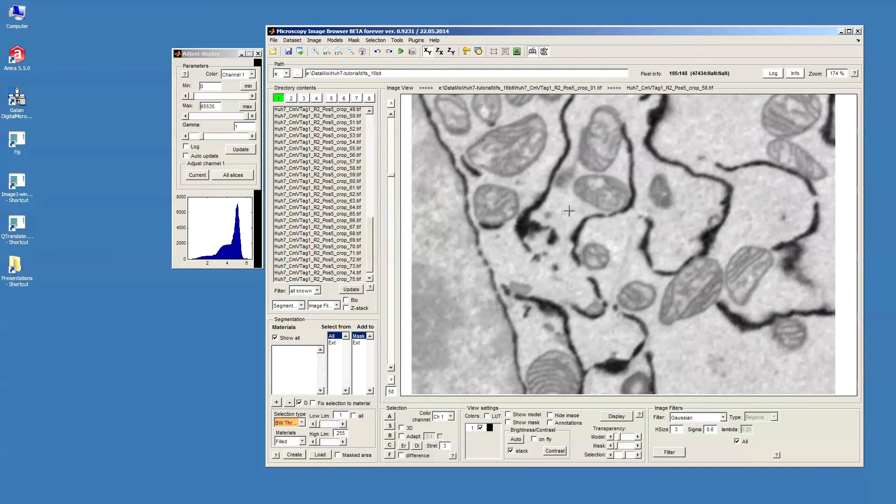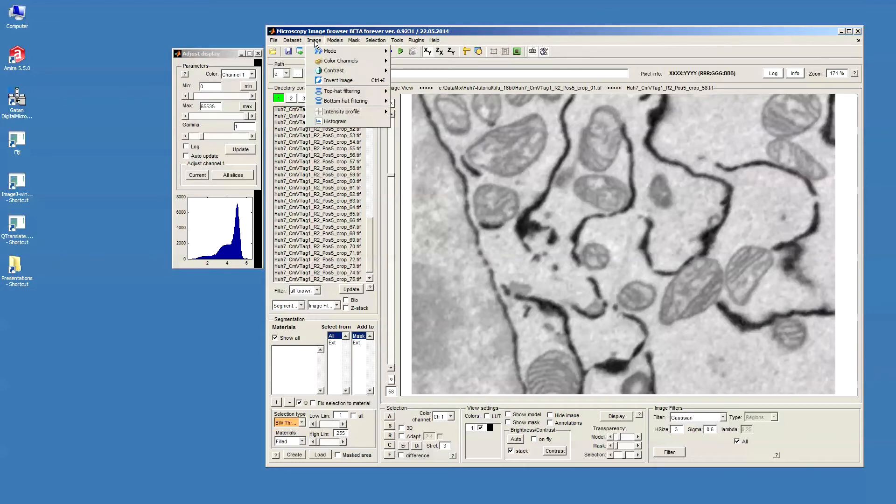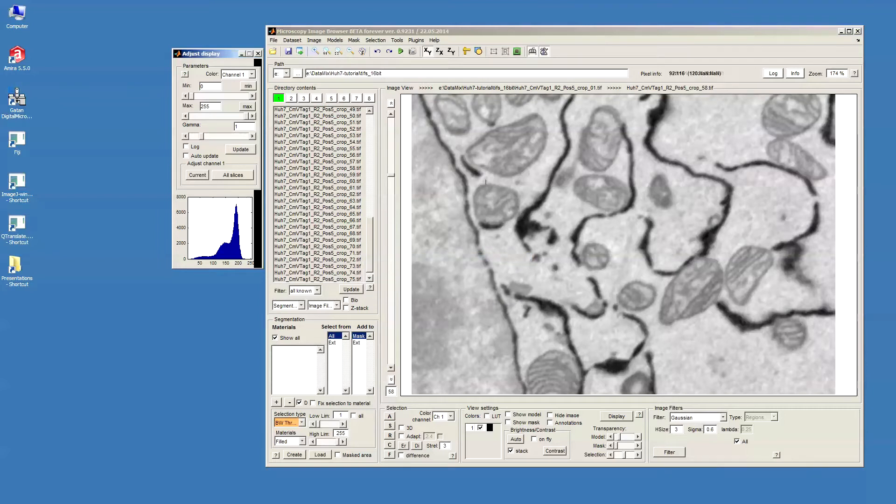The next step, now the data was stretched but it's still in 16-bit format and I need to convert the data to 8-bit format. This can be done from the menu: Image, Mode, 8-bit. Now the data is converted.